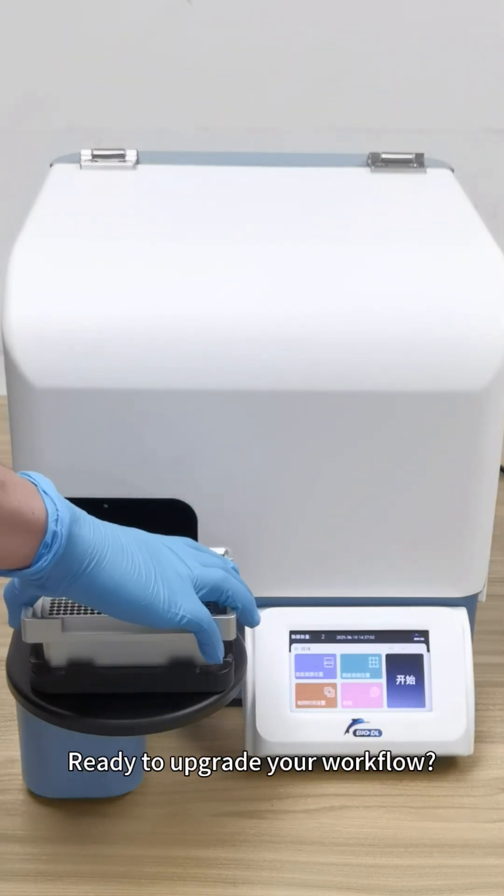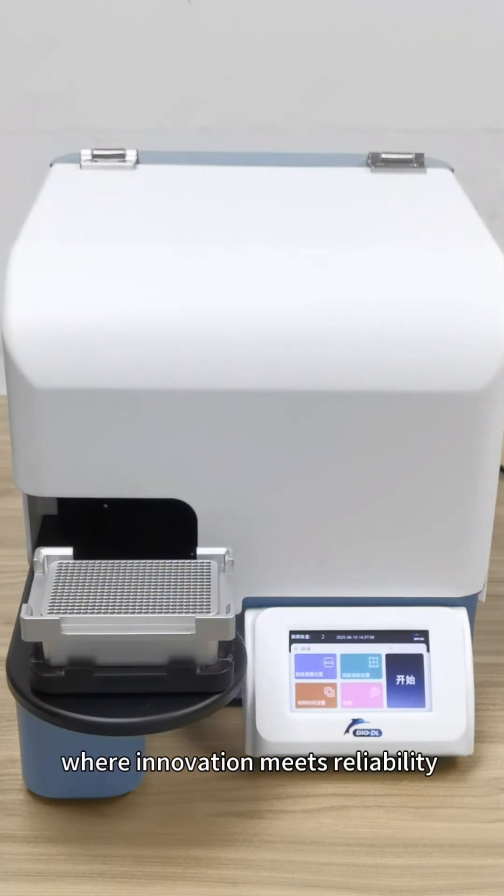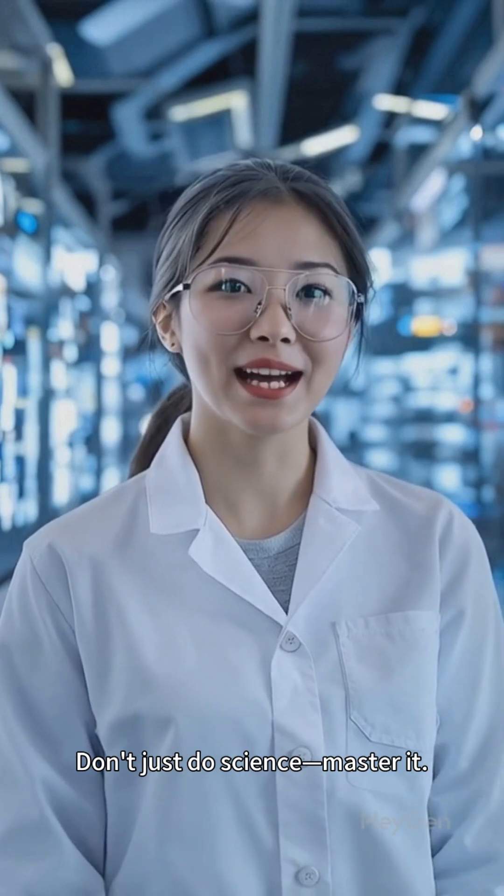Ready to upgrade your workflow? Click to browse my homepage to explore BioDL, where innovation meets reliability. Don't just do science. Master it.